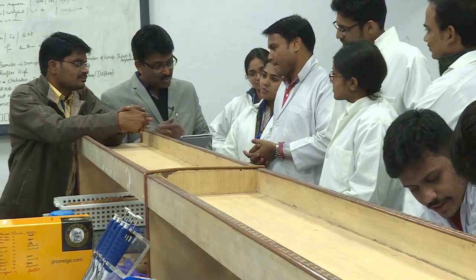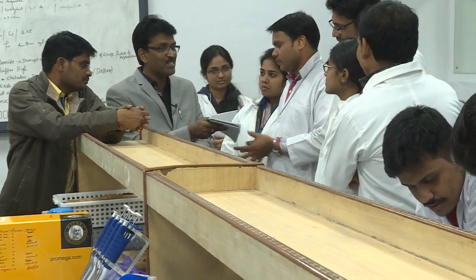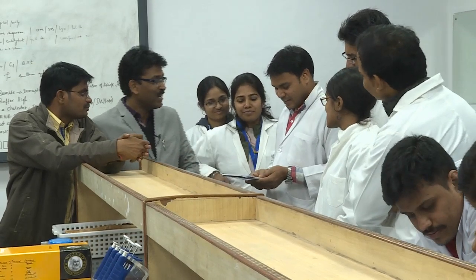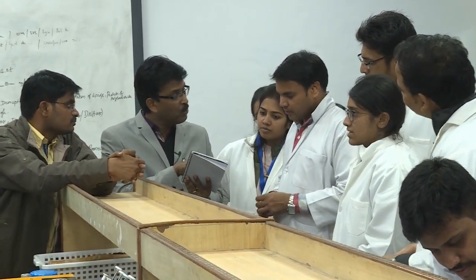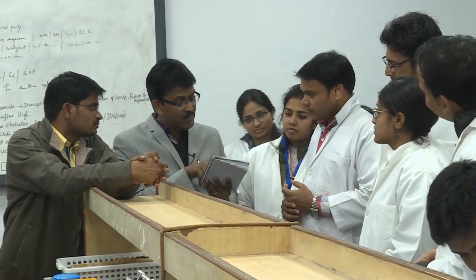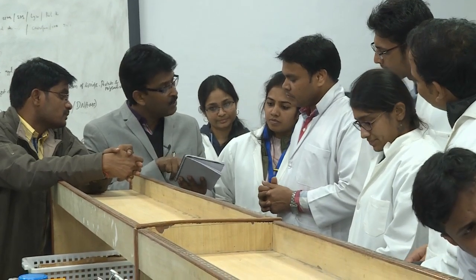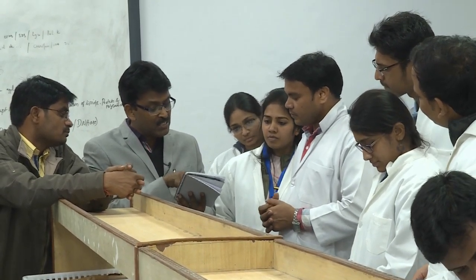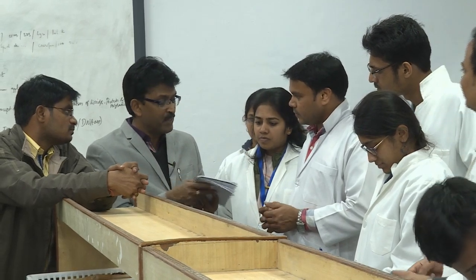So now the question is, you take one from here for your PCR. Let's see what is going to come out of it. Now you calculate for 137.2. You calculate for 100 and 386, the corresponding one. You take 100 here, and this is already maybe 100, and here also you make 100 and go for PCR.